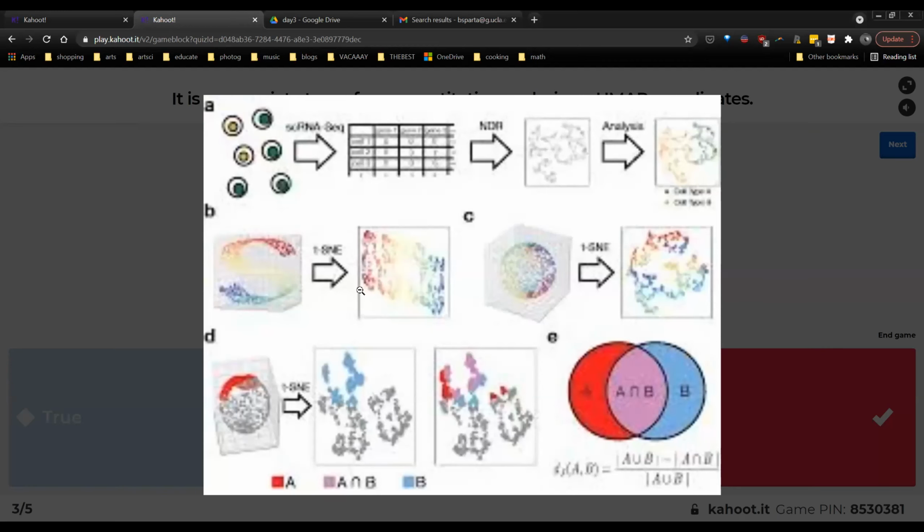So people have some sort of faith in the biostatisticians and the math that clustering will somehow recover appropriate sets of cells. And also it's pretty intuitive to look at a t-SNE projection and see patterns in it and make some inferences about how cells move through this t-SNE space.